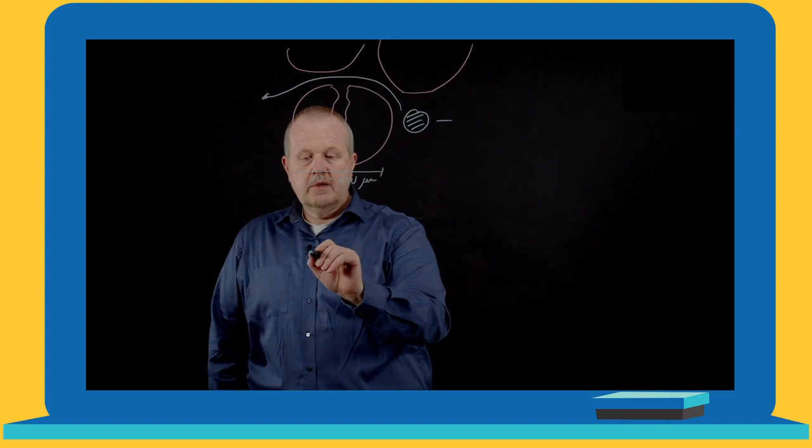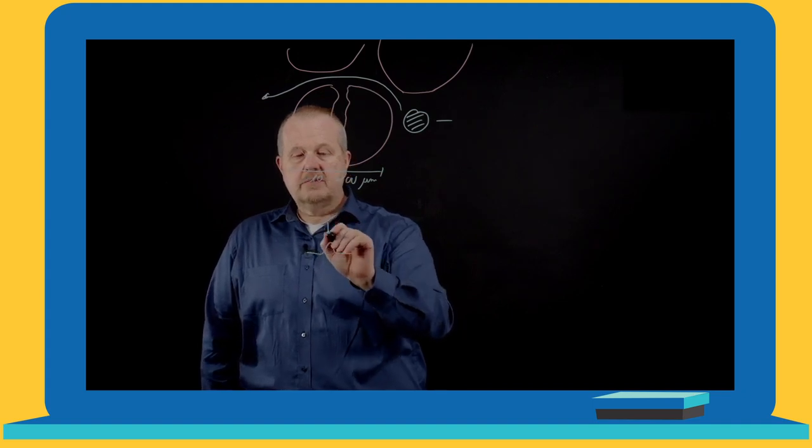So this will go through the extra-particle volume and will come out of our chromatographic column quite soon. So then we have something which elutes here with t0, the column dead time we already learned in the first part of our video. The smaller compounds to be separated will also be transported by convection, by the flow which our pump is delivering, but they are able to penetrate into our pore system.